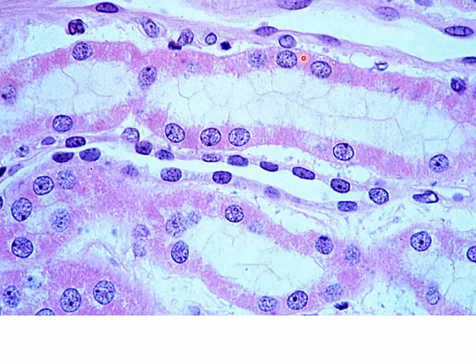This looks similar in some ways to our proximal convoluted tubule in the number of nuclei, but you see how much shorter the height of our cells is. So this is going to be one of our thick limbs, and this is going to kind of be a transition. I'm sort of leaning a little bit, because of the shortness of these, toward thick ascending limb, but this is not one that I would ask you on our practical exam. This is sort of one of those gray areas in between.